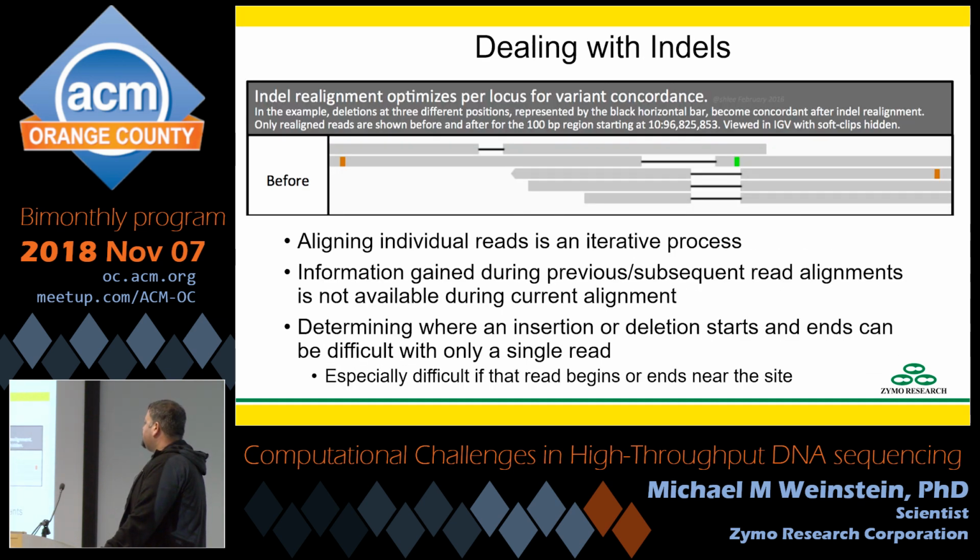Dealing with insertions and deletions, and here I'm going to actually abstract away from the sequence and go just to these bars to show. We definitely have a deletion going on here, represented by that black line. But we can see here all the reads don't exactly agree on where it is. And this is because aligning each read is an iterative process. It's actually nice that it's an iterative process because when you run it on a Burrows-Wheeler aligner, you can multi-core it really easily, and you get a linear boost with multi-core.